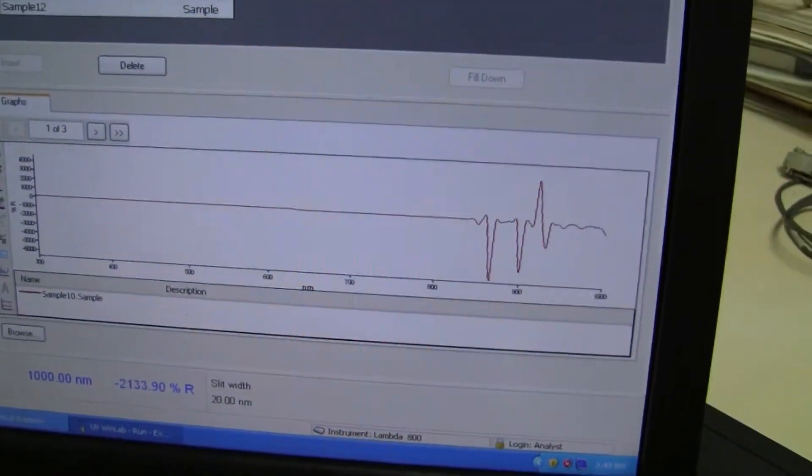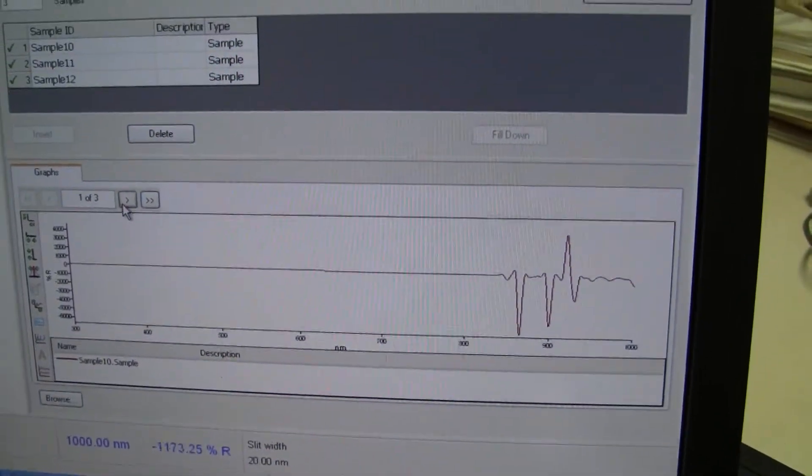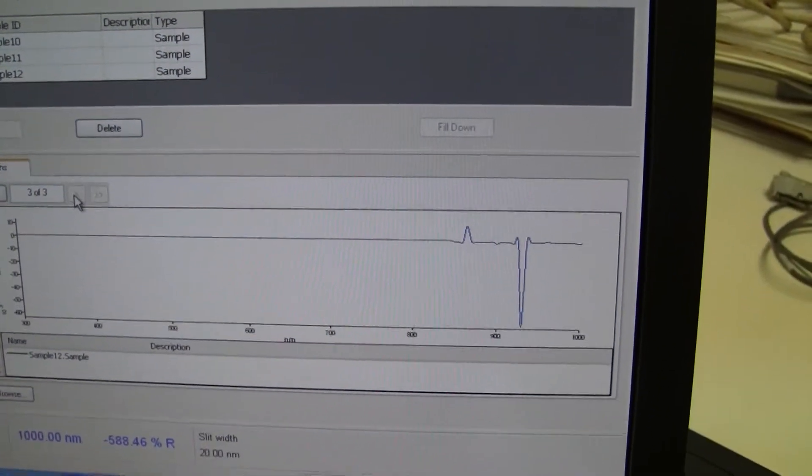I've got some outstanding data and right here I'm going to scroll through the data showing you that the curve has changed.